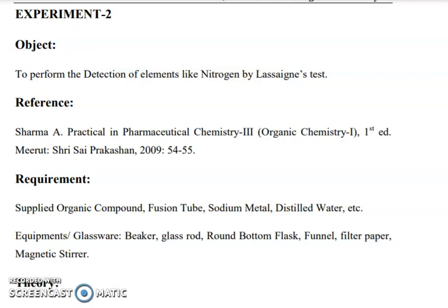Today in this video, I am going to talk about chemistry experiments. So let us start learning chemistry experiments. The first experiment is to perform the detection of elements like nitrogen by the Lassaigne test. So what is your requirement?